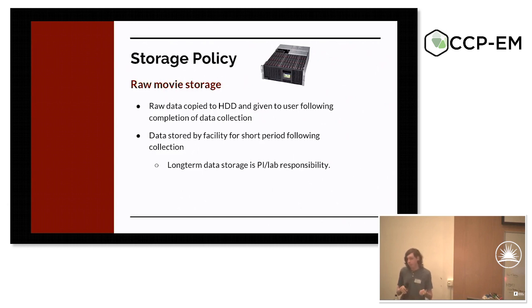Now, I said we have a relatively small amount of storage on site, so in the region of 350, 360 terabytes. Now, if we're collecting 5,000 images per microscope per day, you can probably do the math to realize that's not enough storage for the amount of data that we collect. In fact, even though we've only just officially opened to our user base, even in our commissioning period, we've collected close to 300 terabytes of data. So that's not happening. So we, as a facility, decided to offload the responsibility for our data storage and data handling onto the users themselves.